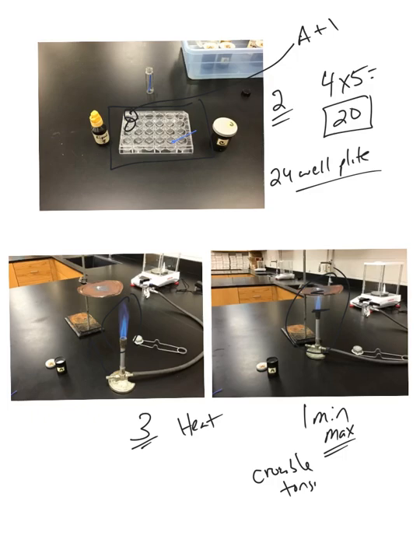So when you are done, you have your data table completely filled out about your individual powders. What are the unique physical and chemical properties of each to help identify them? Okay? If you have any questions, again, send me an email or Canvas notification, but that's the goal of day 1. Okay? I'm going to go back and show you the first page.